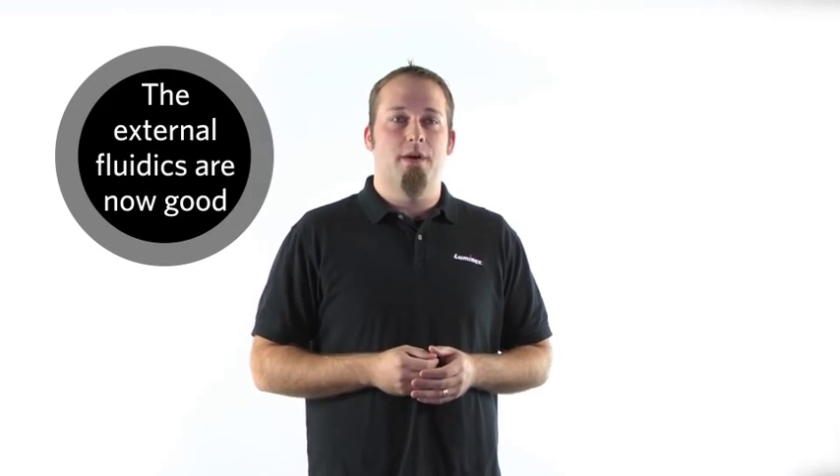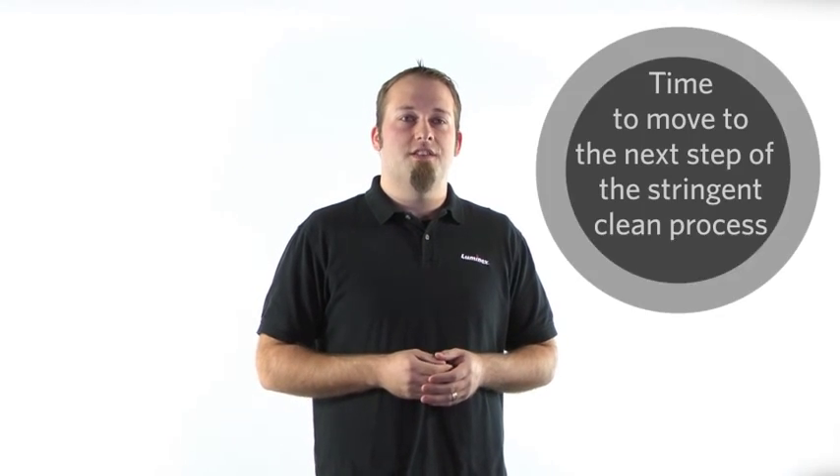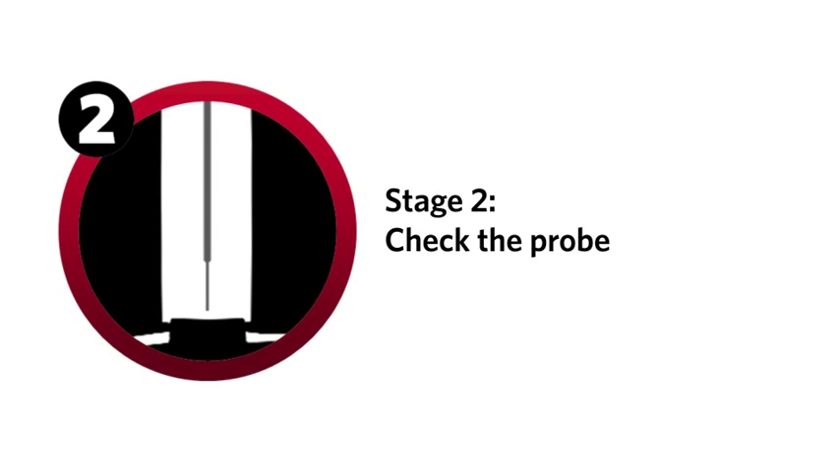Now that the sheath fluid levels are good and the waste container is ready, we can move on to the next step of the stringent clean process. Stage two: check the probe. The second step is to clean the sample probe and set the proper height. If there's anything clogging the probe or if the probe height is not correct, it can affect sample acquisition. Here are the steps to make sure the sample probe is functioning properly.